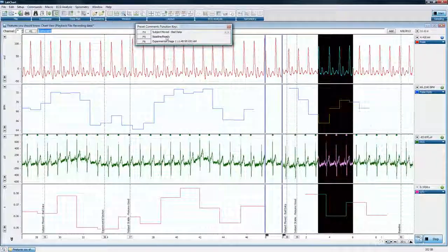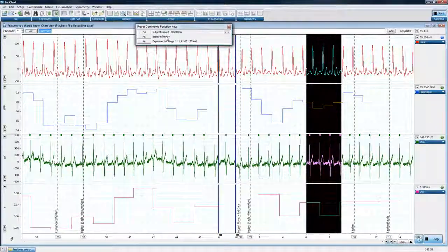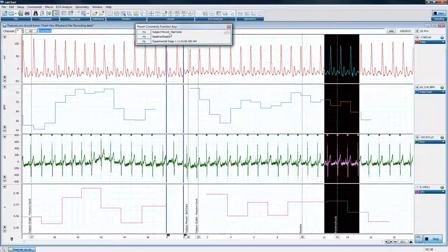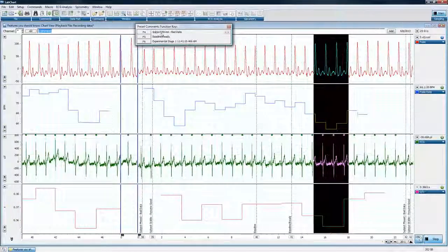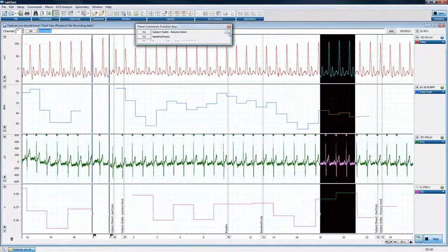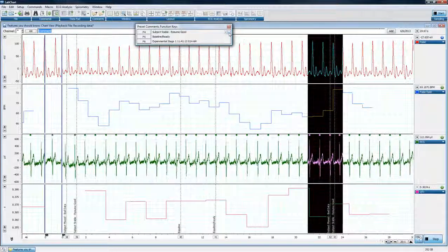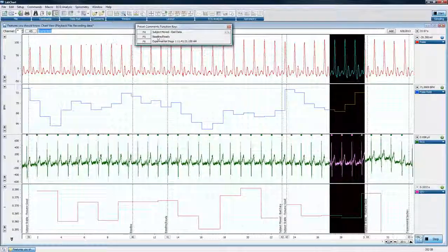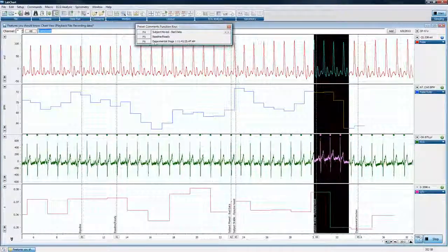F5 is different. F5 is set up for baseline ready. That comment, if I click it, is just simply the one comment. So you can see the difference between what happens when I put multiple comments on the same button. They will go in order, unless you click on these arrows, you can choose which one you actually want before you put it in. Okay? Or you just simply have one comment associated with one button.